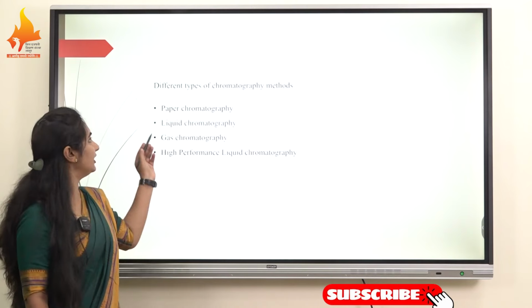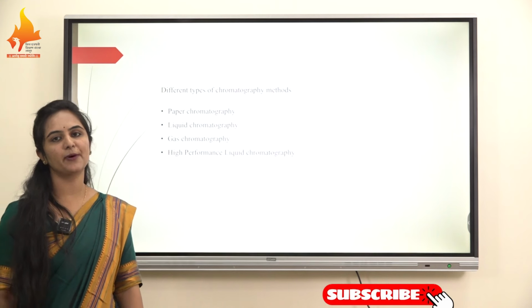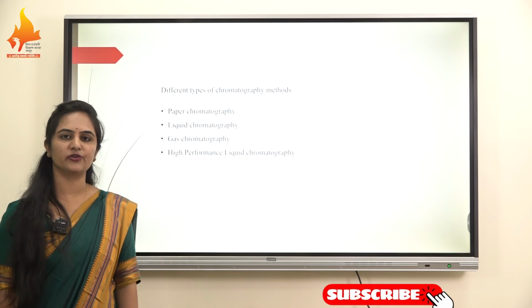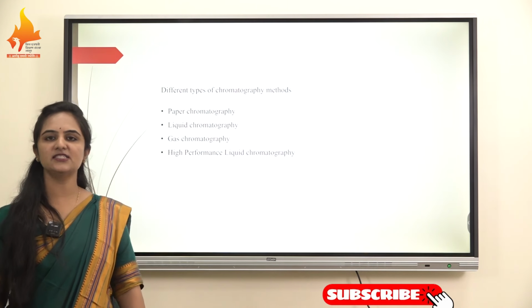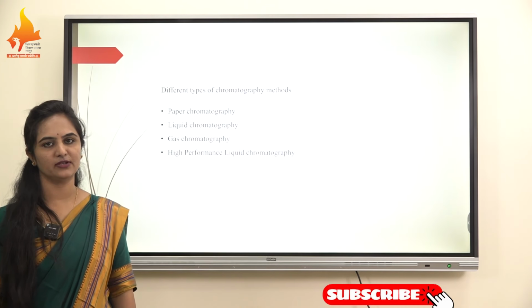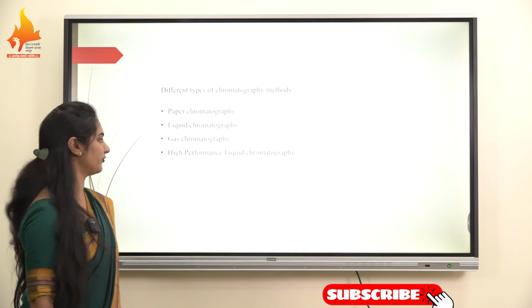There are different types of chromatography methods. First is paper chromatography, then liquid chromatography, then gas chromatography, and last is high performance liquid chromatography. Today we are going to learn about high performance liquid chromatography.